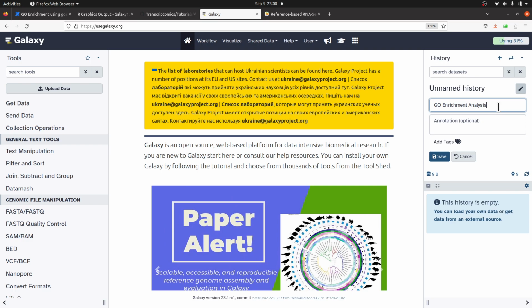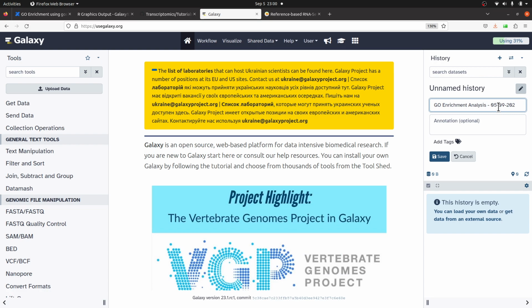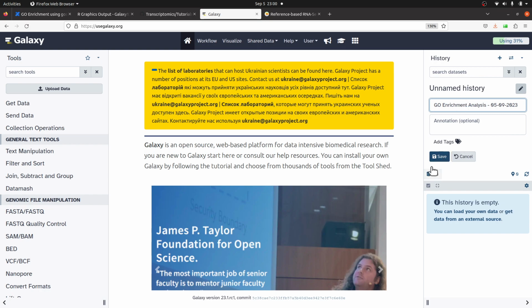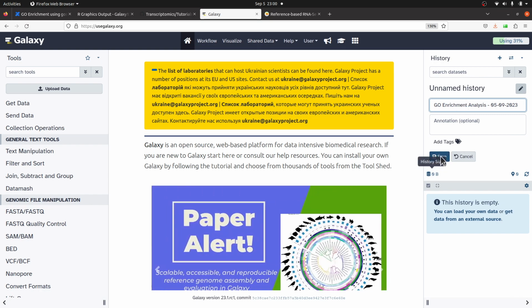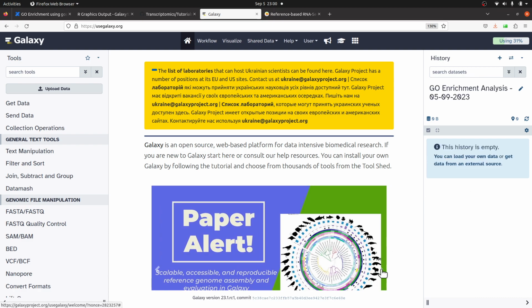You can use any name of your choice. I can also add today's date to it just to keep track of my activities. So the name is up to you, but just make sure you have a name that you can track, and then I will save it. All right, that has been done.